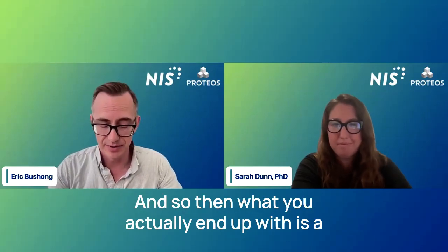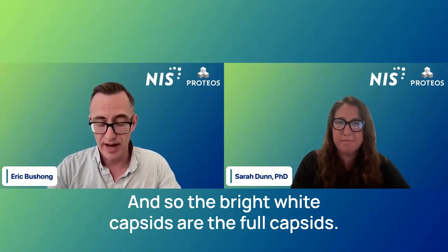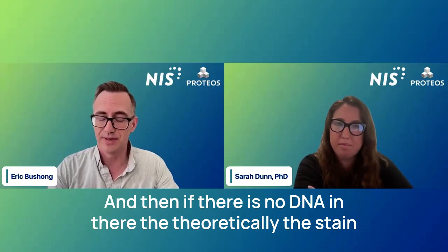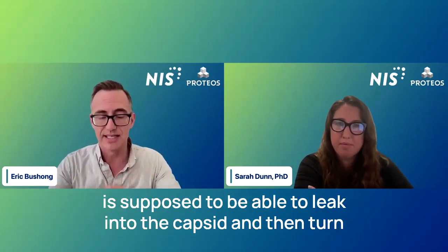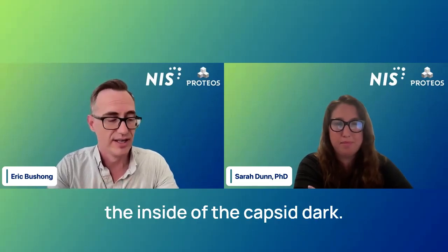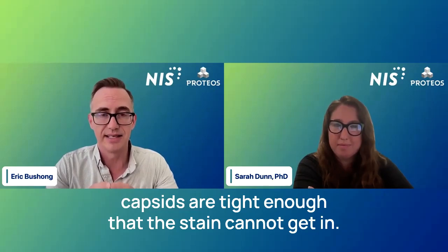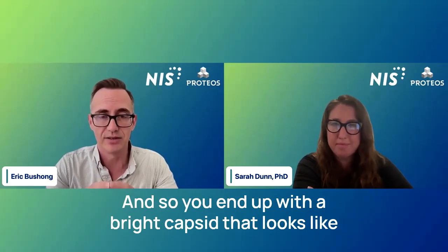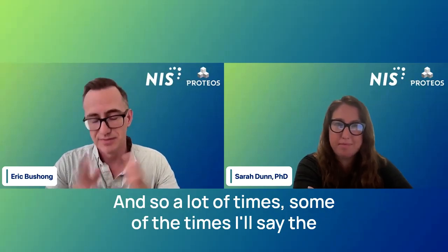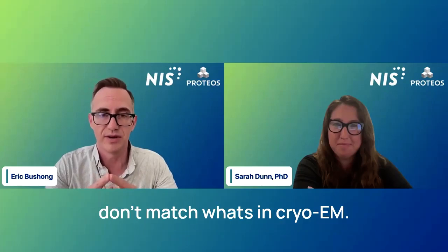So what you end up with is a bright white capsid because there's no uranium inside of it, and the bright white capsids are the full capsids. If there is no DNA in there, theoretically the stain is supposed to leak into the capsid and turn the inside dark. But sometimes that just doesn't work, because the capsids are tight enough that the stain cannot get in. So you end up with a bright capsid that looks like it's full, but it's actually empty. And so some of the time, the results you get from the negative stain approach don't match cryo-EM.